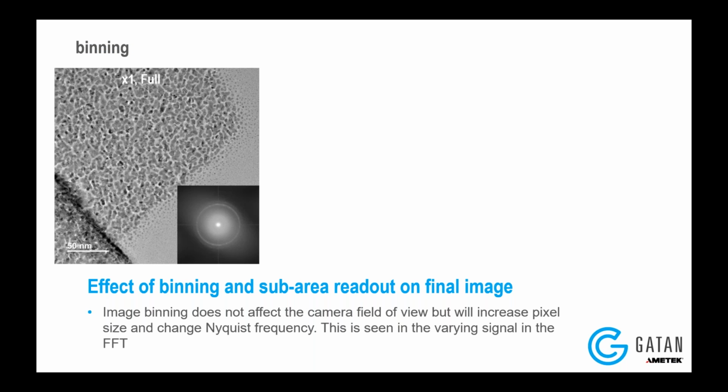But there's something important that's really key to understand about how the camera works with these different binning and sub-area combinations when you're interested in analyzing your sample.